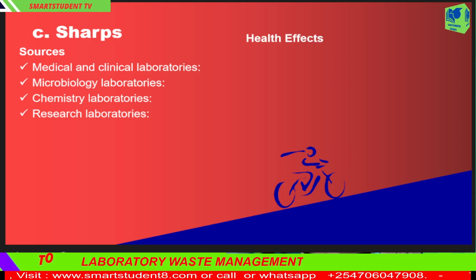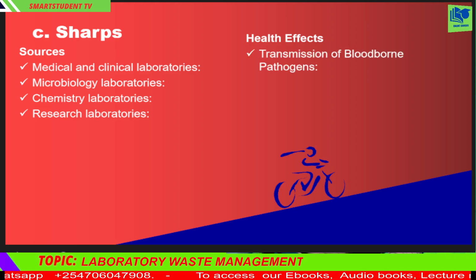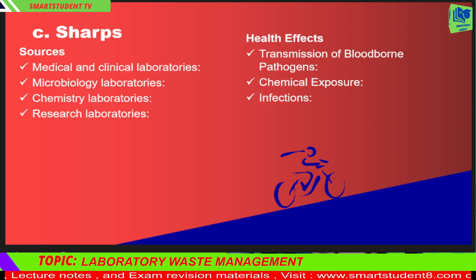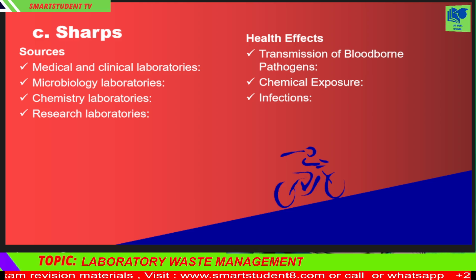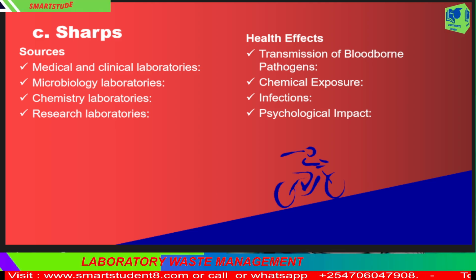5. Health effects of contaminated sharps. Exposure to contaminated sharps can pose serious health risks to laboratory personnel and waste handlers. Potential health effects include: 1. Transmission of blood-borne pathogens. Diseases such as HIV, hepatitis B (HBV), and hepatitis C (HCV) can be transmitted through needle-stick injuries. 2. Chemical exposure. If sharps are contaminated with hazardous chemicals, exposure can result in chemical burns, poisoning, or long-term health effects. 3. Infections. Bacterial, fungal, or viral infections can occur if pathogens are introduced into the body through sharp injuries. 4. Psychological impact. Fear and anxiety following an injury from a contaminated sharp object can affect mental health.